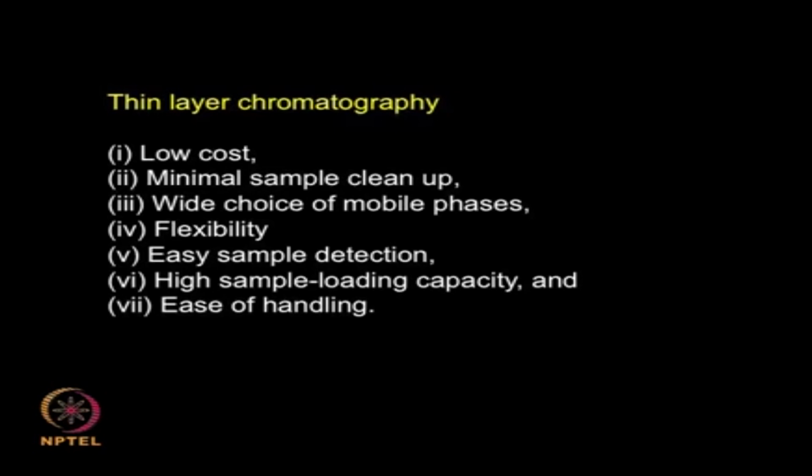Right. Now a well known chromatography which is practiced by organic chemists for the past 50-60 years is called TLC, thin layer chromatography. It is low cost, it treats a minimum sample, so cleaning up is easy, we can use a wide choice of mobile phases, it is very flexible, easy sample detection, we can even load high samples and ease of handling. So all these are very advantageous, which leads to the use of TLC by all the organic chemists.